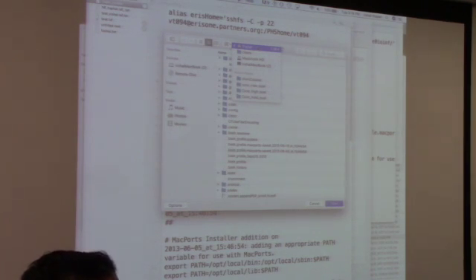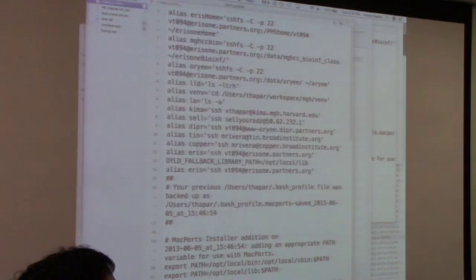Got it. So on Windows, sorry, you don't have an equivalent. But no, I found it. You found it? Oh, awesome. Yeah. Oh shit, I should not put that.